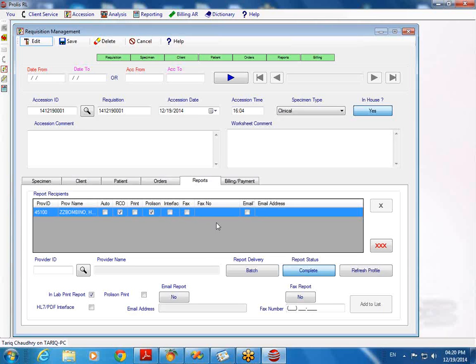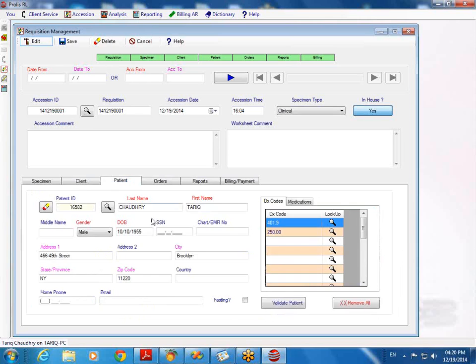So in terms of the patient tab, can you configure it so that we would add additional information for those patients? Like what kind of information are we talking about? This is the patient tab. As part of our report, we actually need to report some of the pathology information for those specific patients, and it needs to be recorded in our system.